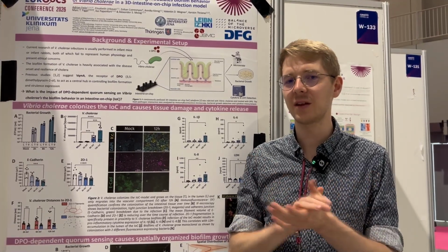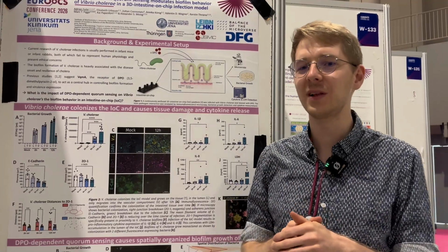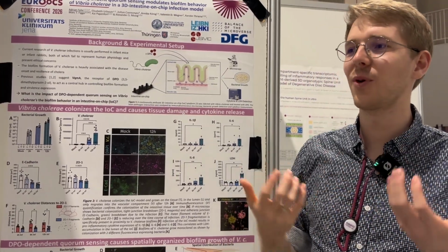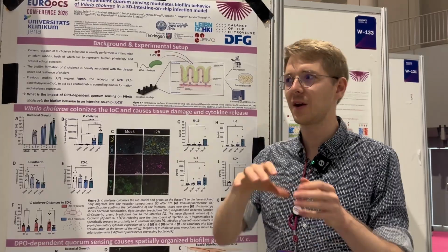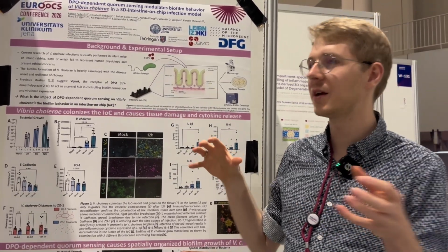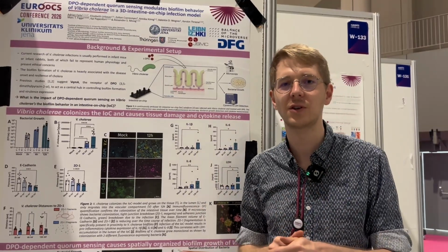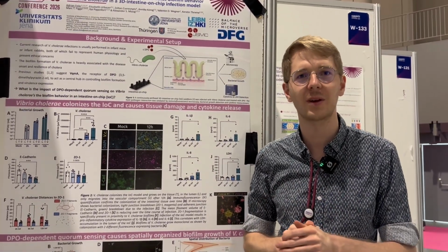And the cool thing then is once you've established your model and it's running, you really have this capability of exploring a new biology where we have now shear stress going in, we have the replacement of molecules, we have gradients that are building up inside of the chip, and this is something that traditional cell cultures are just not able to recapitulate.